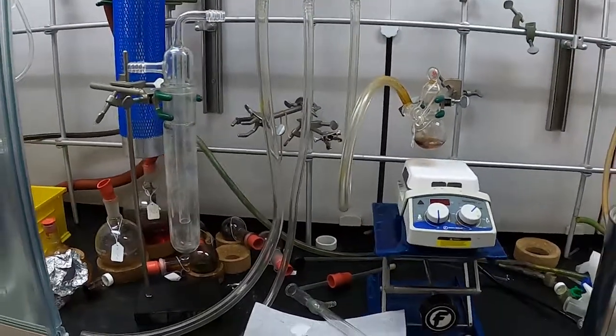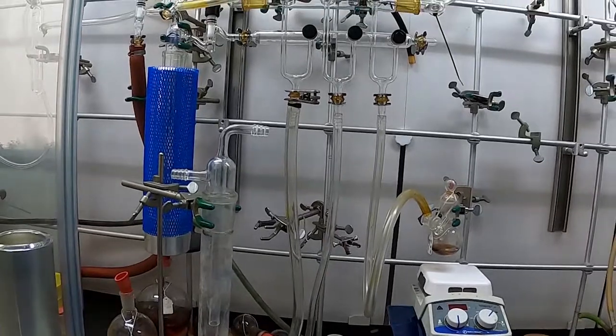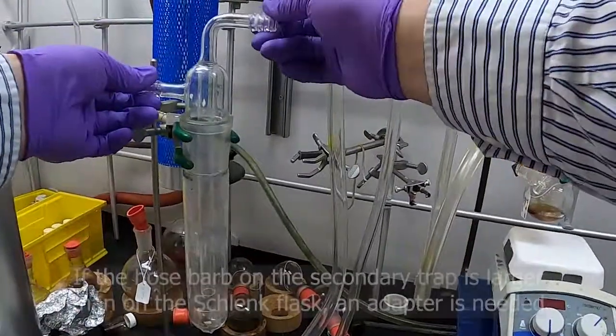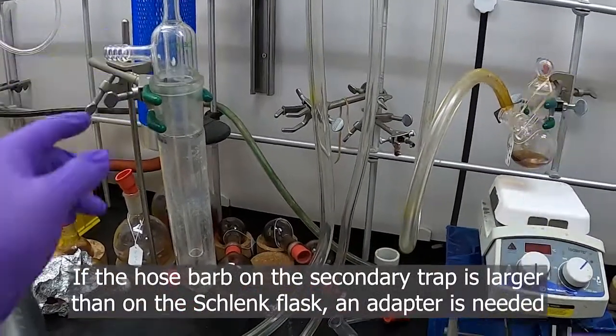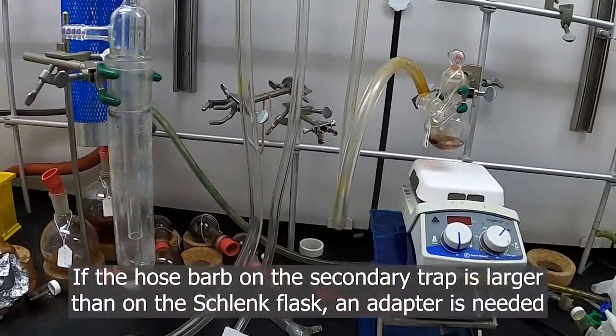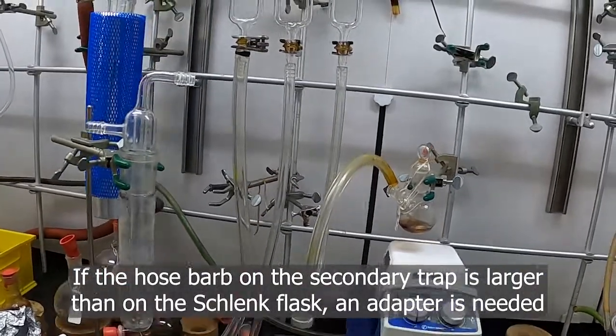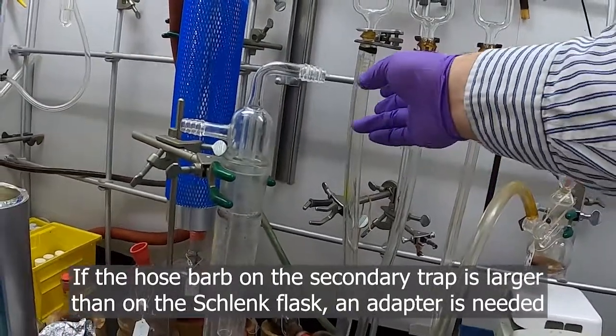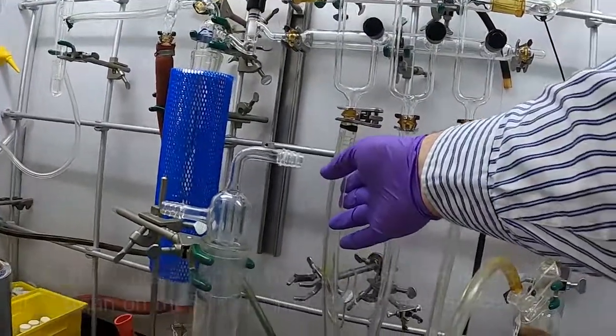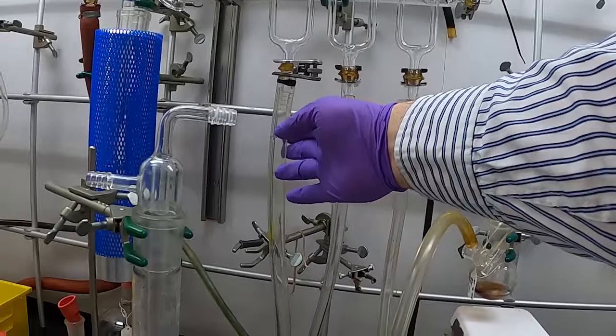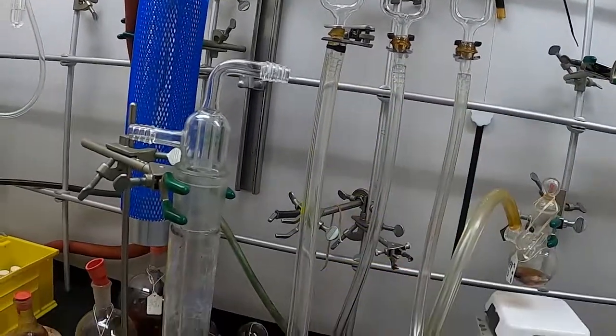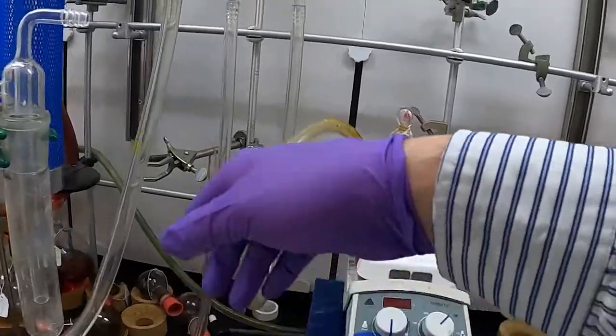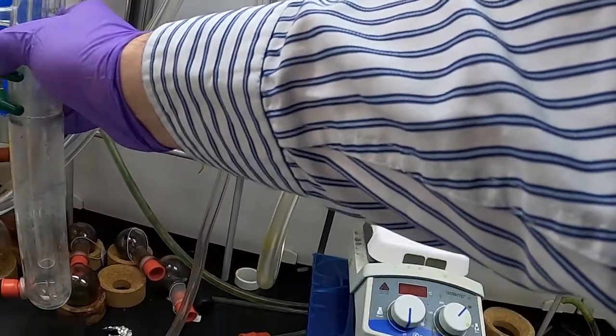This particular external trap has larger hose barbs on it than the actual flask, so we need to do a little bit of adapting. Our Schlenk line has these nice little ball valves where we can adjust for different tube sizes. I've already connected the larger side's tubing here on the far left tap because we're going to have the larger volume here. We'll connect the vacuum to the side over here to the vacuum trap.